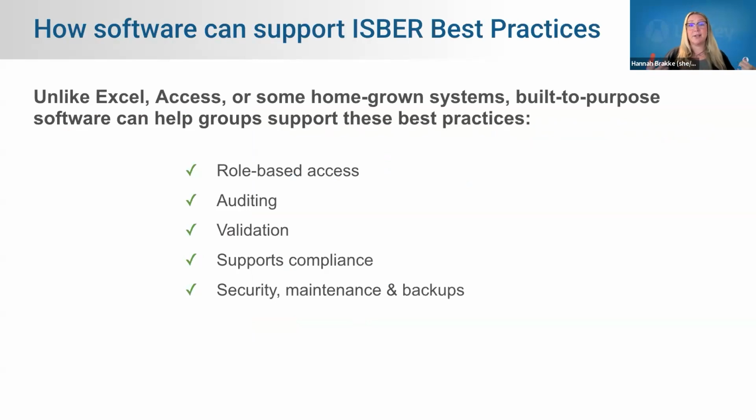A lot of biobanks start out by using Excel, Access, or homegrown systems. These can be really effective in the short term, but they often start to fall short when it comes to supporting these ISBER aligned best practices at scale and over time. A purpose-built solution like LabKey's can be designed specifically to help biobanks with these best practices.